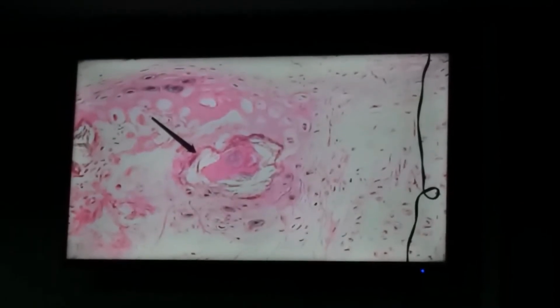Epiglottis. What type of connective tissue fiber? Elastic. What is the fundamental type? Connective. What is the subtype? Cartilage. Specific subtype? Elastic cartilage. What is the parenchyma? Chondrocyte. What is the arrangement of the parenchyma? Singly or isolated. Alright, so that is the second type of cartilage.